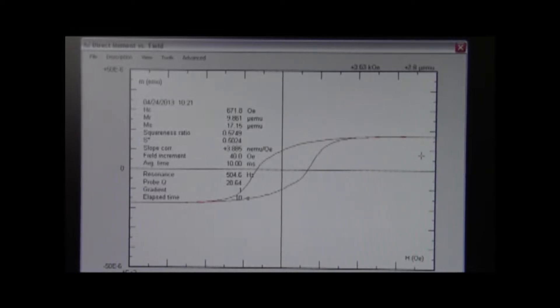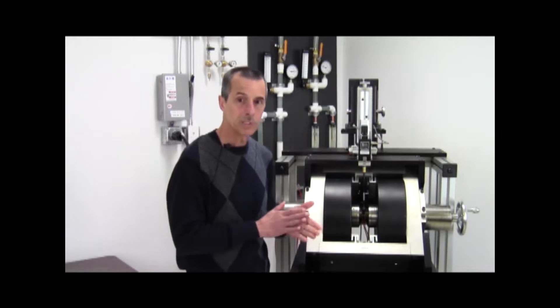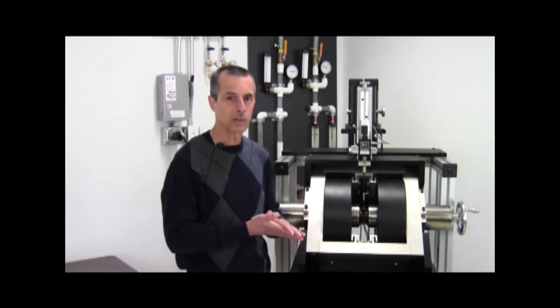I think this adequately demonstrates the speed of the micromag magnetometers, and in this case, you can also see that we have excellent signal-to-noise. This is very low noise in the data, very little scatter, so this also gives you an indication of the sensitivity with which one can conduct measurements. This was a quick demonstration of the sensitivity, and the measurement speed of the micromag magnetometer product line.